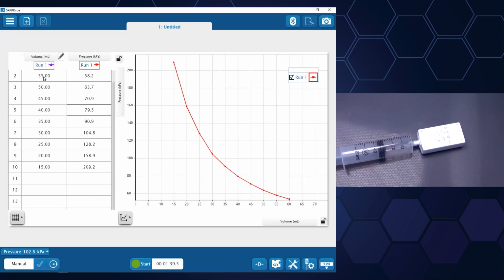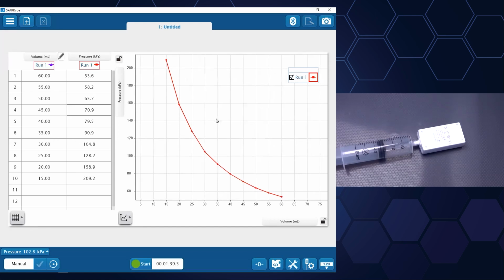And it's simply the times at which I wanted to record the data that gets recorded. And these pressures are associated with their corresponding volumes. All right, so let's take a look at this data. Interesting, so it's clearly not a linear relationship between pressure and volume.